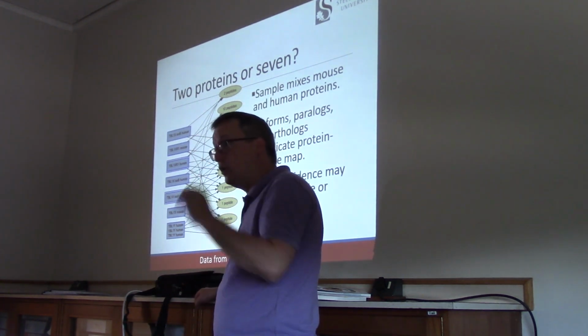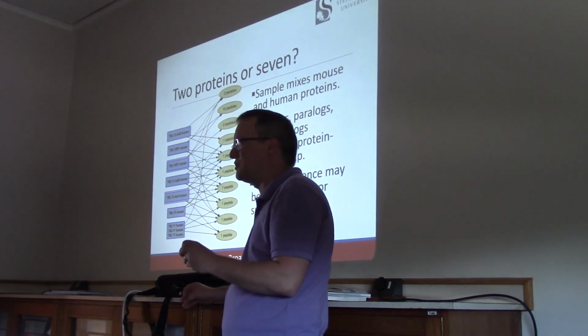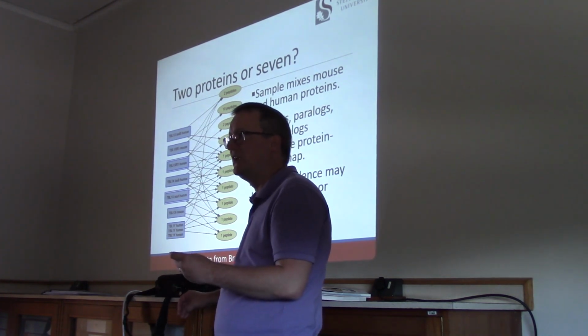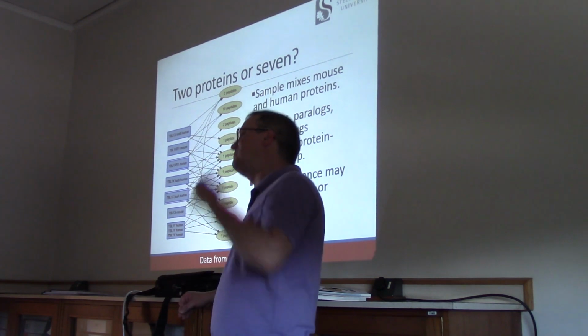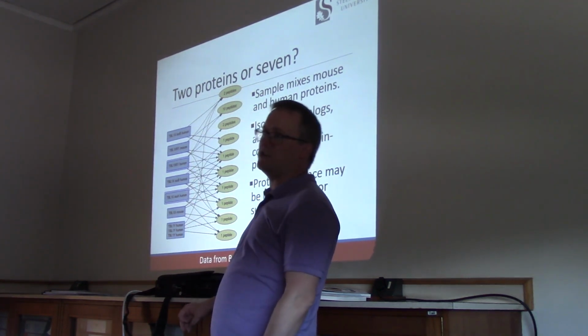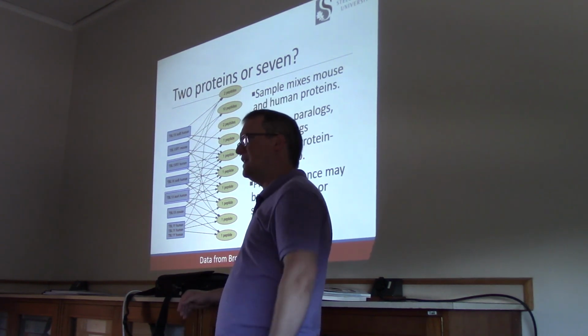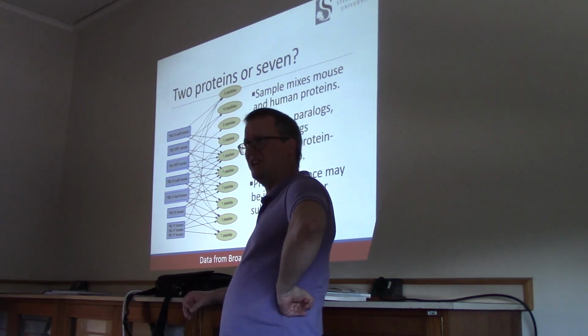So in the old 1990s days, things were really hairy, and it was very much a Wild West atmosphere in proteomics. Everybody wanted to publish the biggest inventory of proteins. Our technologies let us measure 80% of the known yeast genome. Our technology has seen a peptide from every protein in the yeast genome.